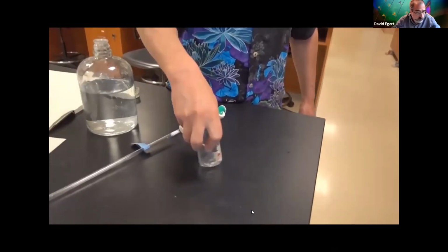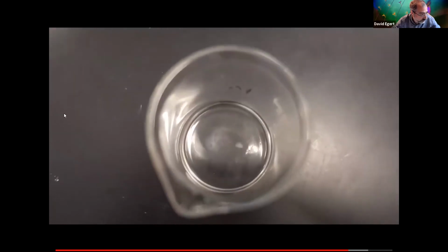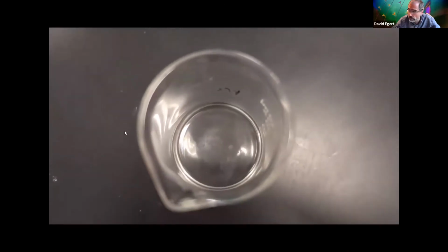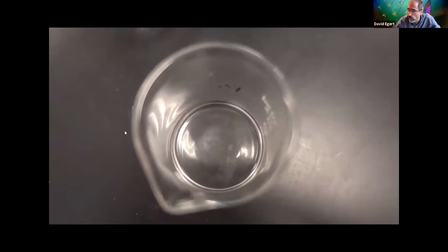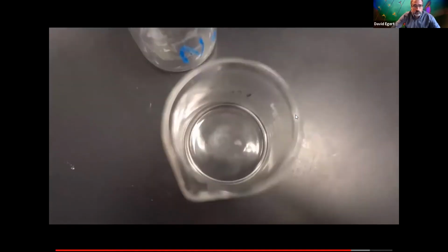And you can take a look. It's worth it, especially if you still have your other beakers out. Like I have a beaker of sodium chloride here. They both look pretty much the same. What does dissolve mean? The crystals have gone into solution.